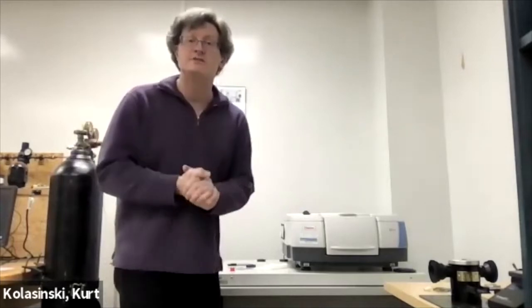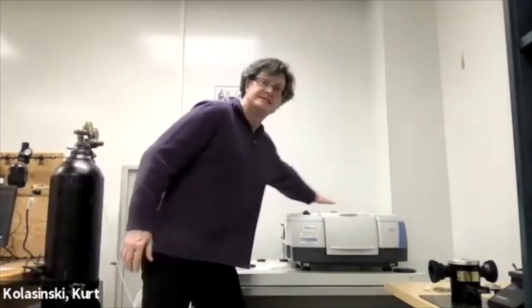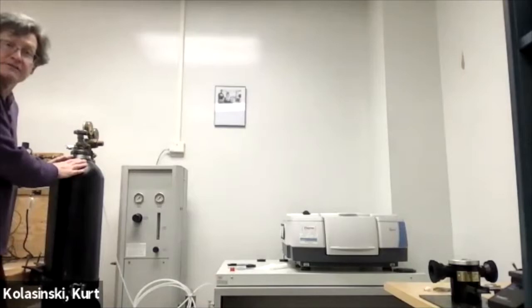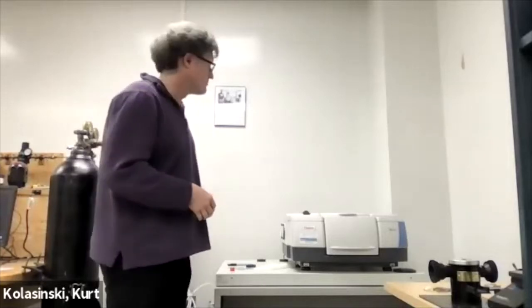Now, depending on how sensitive you are to the background, you may want to purge the entire spectrometer. And you can do that with this nitrogen that we have here. Dry nitrogen can be used to purge, because again, you've got to remove CO2 and water vapor, right?